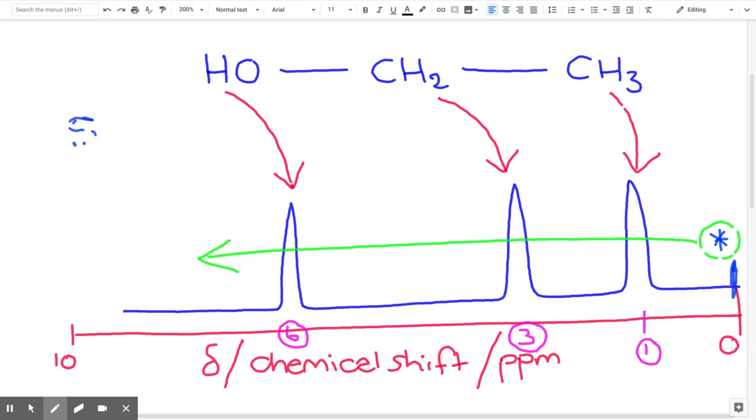It's based around silicon, and it's got the name tetramethylsilane, and it's got a silicon atom in the middle, and it is surrounded then by 4 CH3s. It's not drawing very well. Try that again. So tetramethylsilane, as I say, is a central silicon surrounded by 4 CH3s.